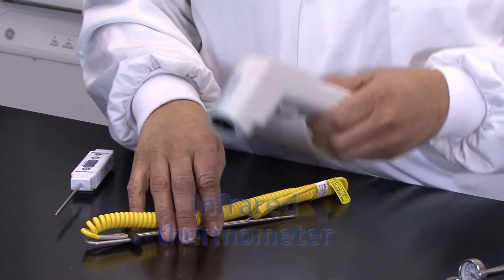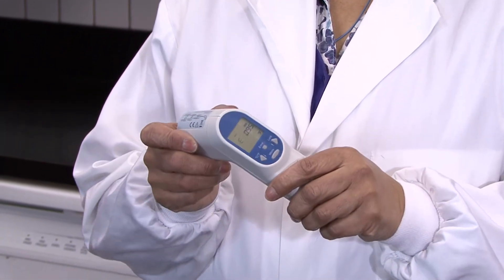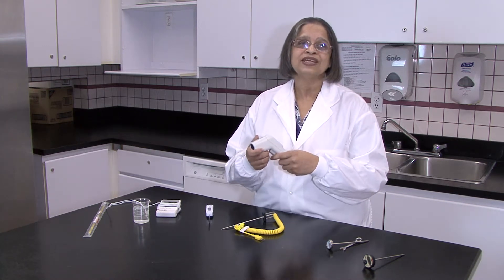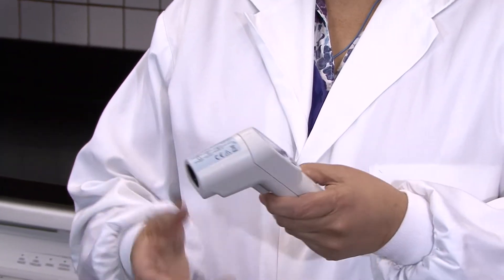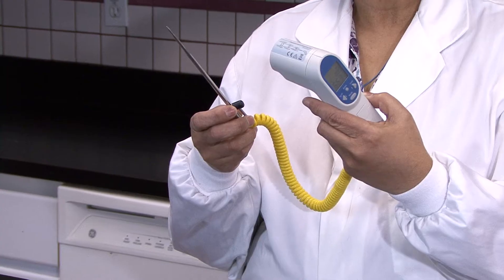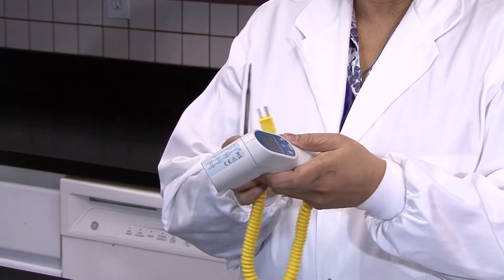This next one is an infrared thermometer. It has a digital readout, which helps eliminate human error, and it is great for measuring surface temperatures or things that are a little difficult to reach, because you just aim it at the point at which you want the temperature taken. It is also available with a probe attachment, which you just connect, and then you can use it to measure internal temperatures of products.